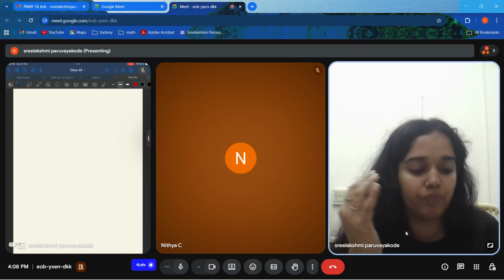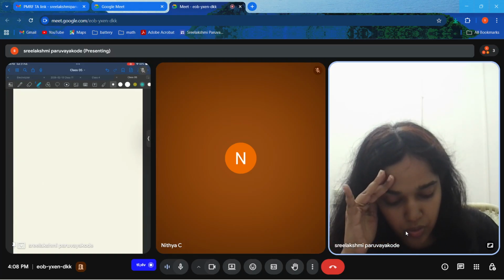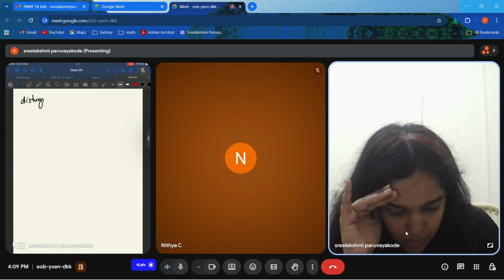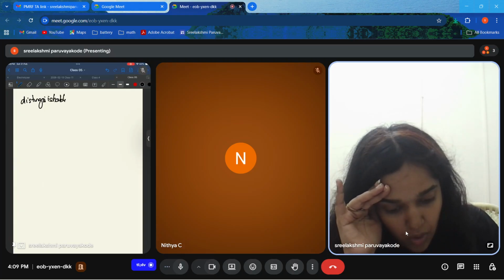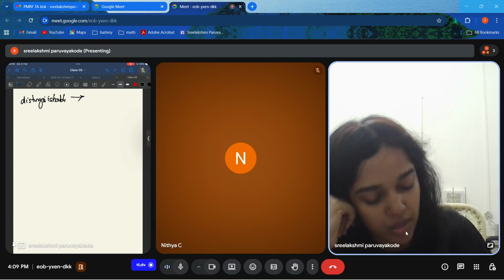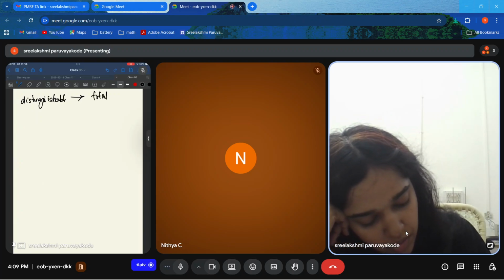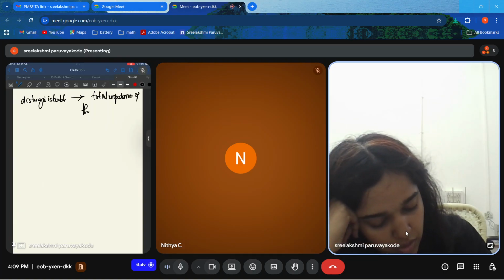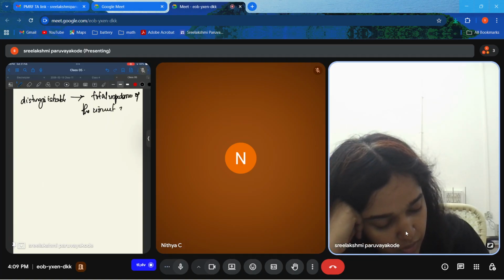Now what should we do? So I already told you, when you say they are indistinguishable, what does that mean? It means that the total impedance of the circuits are equal.